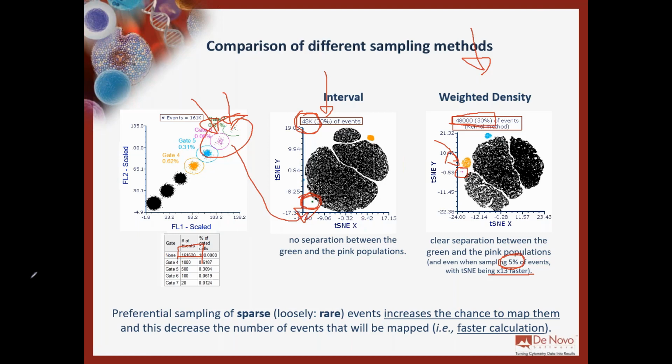So this is true, but it's not completely true, meaning that in informatics, nothing is really random. There are tricks in which you can ask the computer for 100,000 random numbers, and then after a month, you can ask for 100,000 random numbers and receive the same 100,000 numbers as the month before.